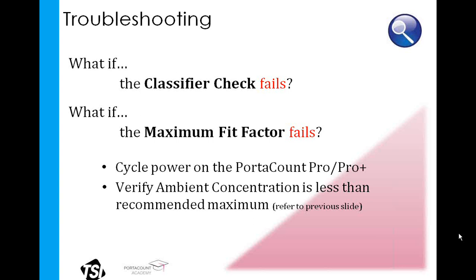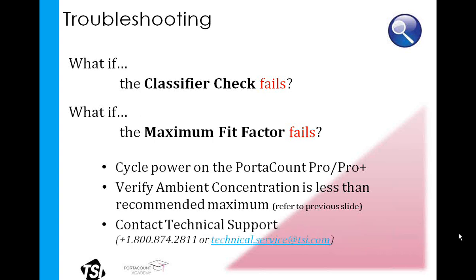Having too many particles, over 400 with the N95, over 8,000 without the N95, can cause problems not only with the zero check, but with passing these checks as well. And then you may want to try contacting our technical support through TSI.